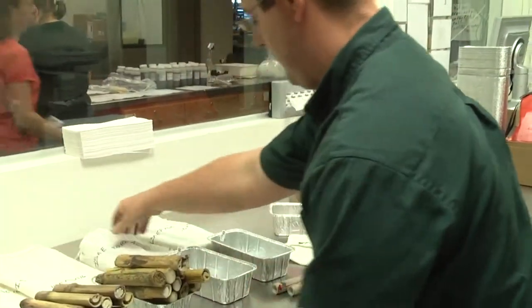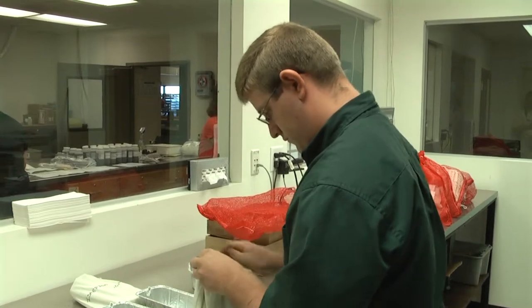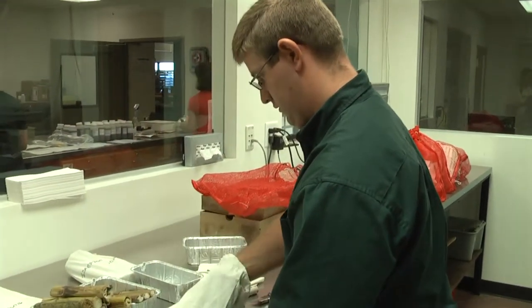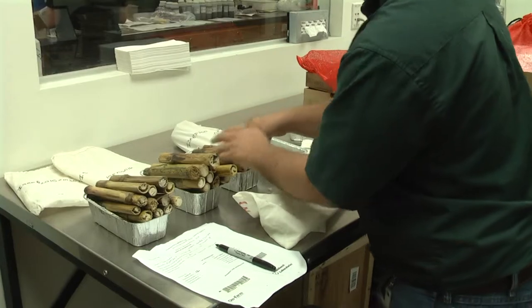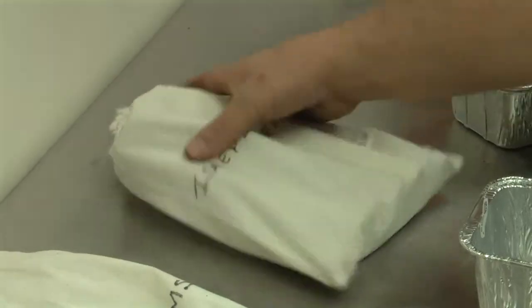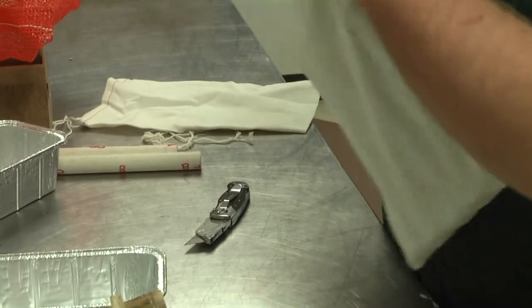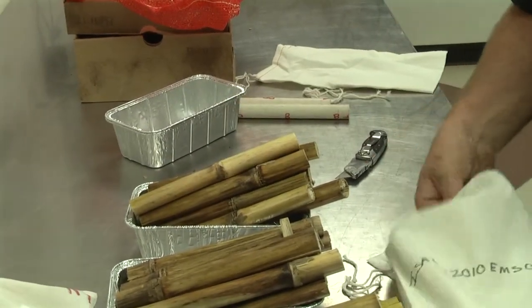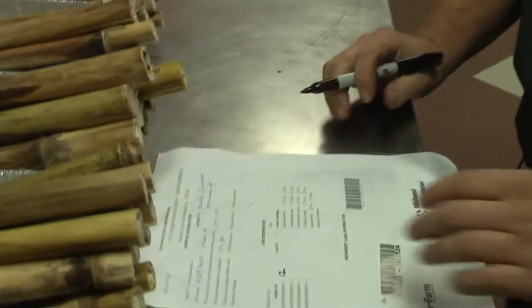Sample two has the correct number of ten. Sample three has ten as well. Sample four has ten as well. We have a checklist on these pre-made auto-submits for the on-farm network.